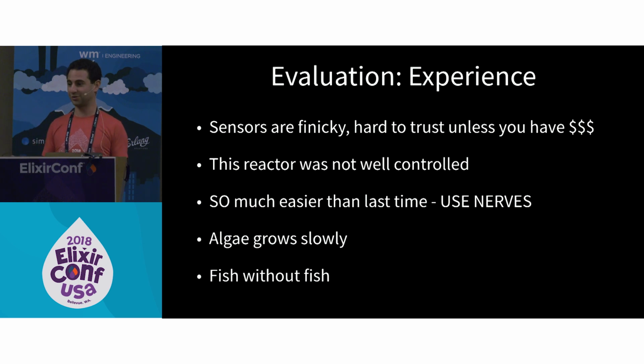So again, this was a huge improvement over the last time I did this. I really recommend people use Nerves for doing embedded programming now. It was a real joy to do this project. I had tons of fun with it. And even if you're doing something like watching algae grow slowly or monitoring your garden, you can just let the system sit there and it'll do its thing and give you data, and you can just build on top of it. It's really fun.